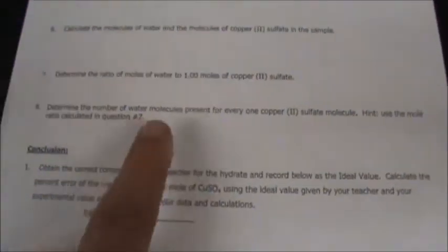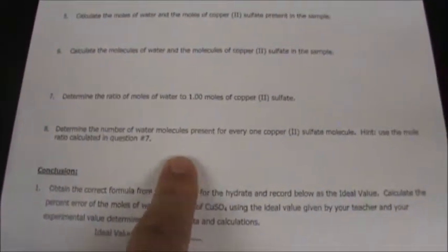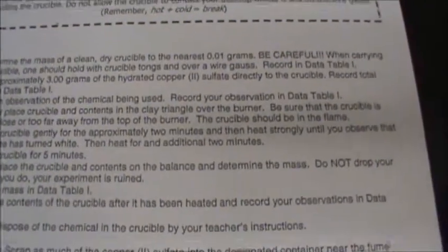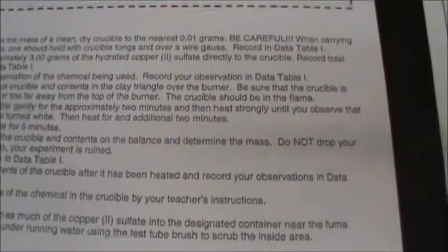And you're going to do the calculations to see if you actually got a pentahydrate from the lab procedure that I will perform right now. So with no further ado, let's actually do this procedure. The very first thing is I want to determine a clean mass, or the mass of a clean dry crucible to the nearest 0.01 grams, and I want to be careful when carrying this crucible. So I'm going to carry this crucible to the scale. So here I go.